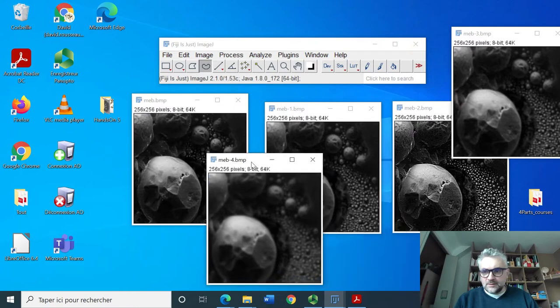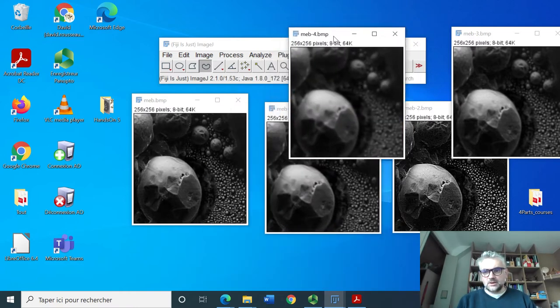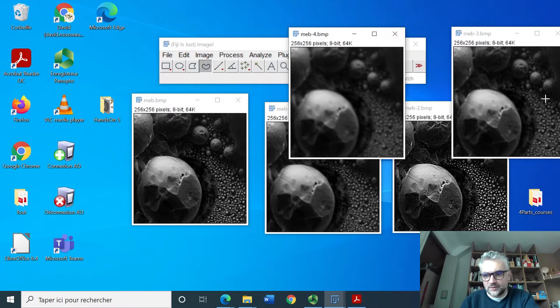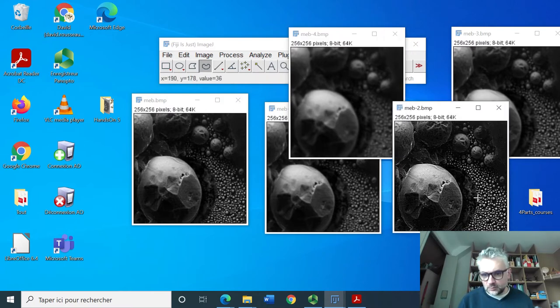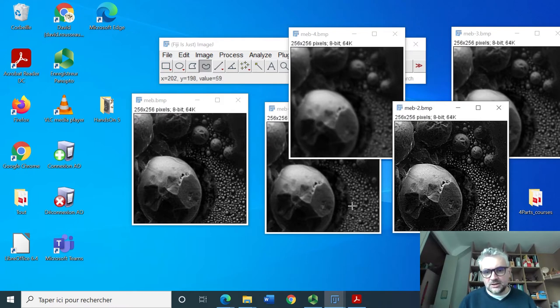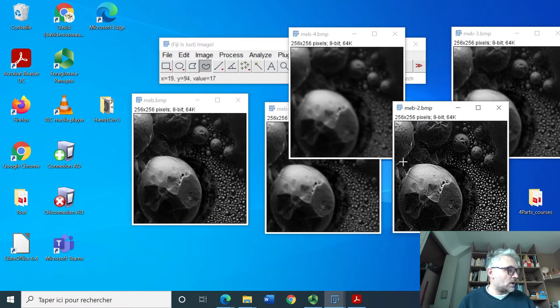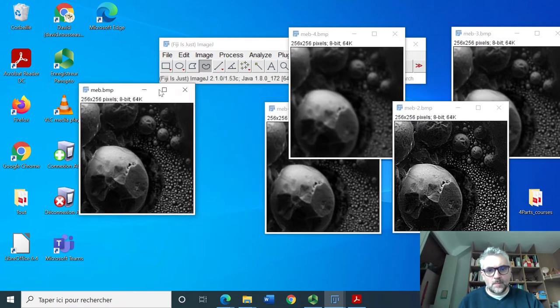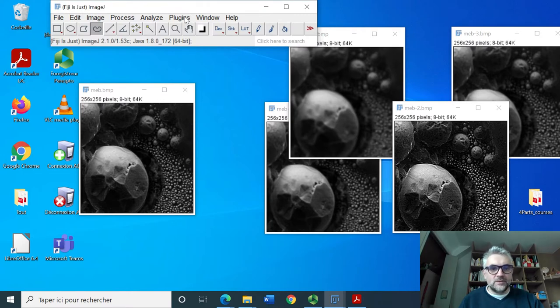This is the kind of images that we have after filtering. We have seen that sharpening was close to something that would enhance the edges while all the other filters were somehow more smoothing the image.